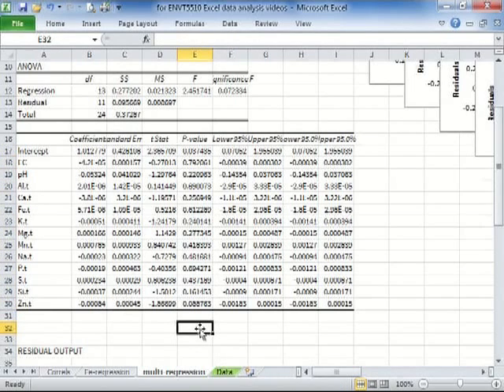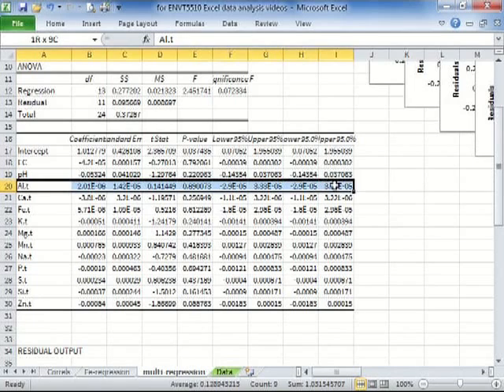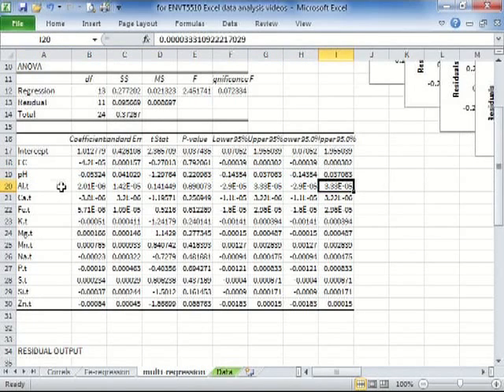Now, what would we do here? Now that we can run the model again and weed out some of the predictors that don't seem to give us much, on the basis of a p-value, basically, or the size of the standard error of the coefficient. That's misleading because we should really use the relative size. So I'm going to focus on the p-value. I'm going to weed out the least significant. Again, that's a bit of a stretch in interpretation of p-values, but we'll go with it anyway.